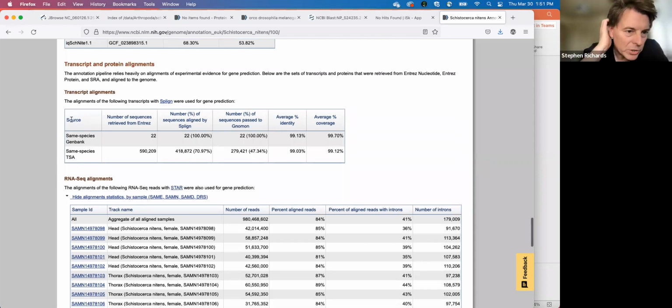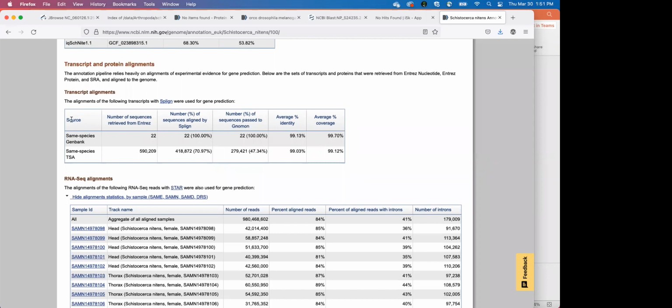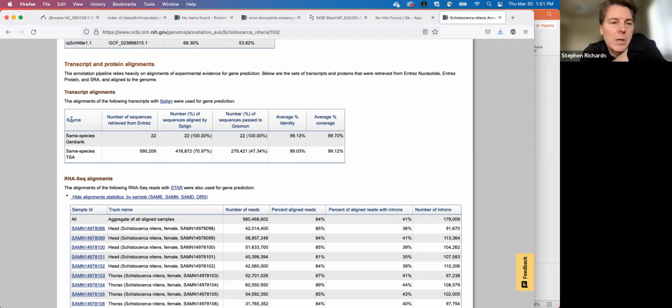I have a question. So we're looking at this gene model. We've got 2 transcripts, and I decide I want to grab the protein sequence of it so I can make a tree with other species or other things. I'm assuming I would simply take the longest one.